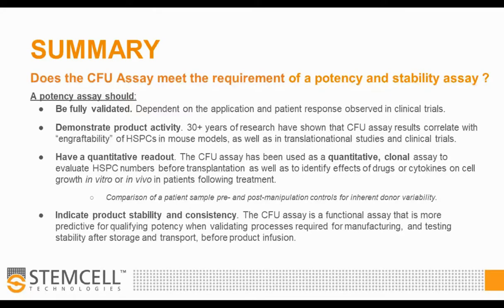And can it be validated? Well, the CFU assay has been validated in some cases for different purposes, like identifying the maximum tolerated dose of chemotherapeutics by adding drugs into the CFU assay and looking at IC90 concentrations, for example. But in this case, it really depends on your application and the patient's response observed in the clinical trial.